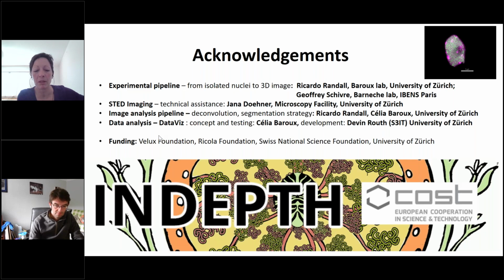And I think what is more critical for super resolution imaging is the type of antibody, and they have to be adapted to the imaging platform. The fluorophores need to be really resistant to the strong, harsh laser imposed in either STED or STORM. Yeah.